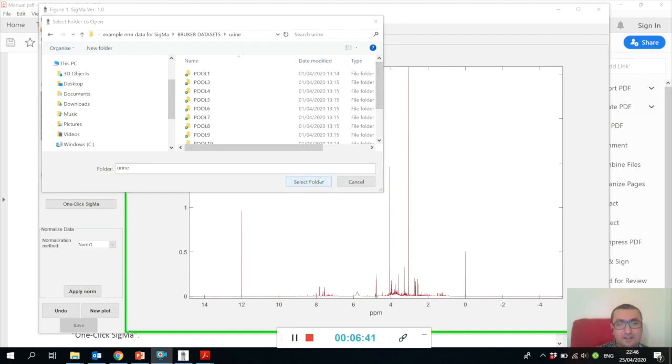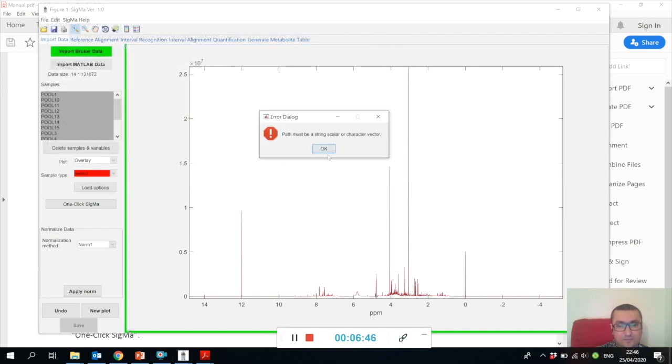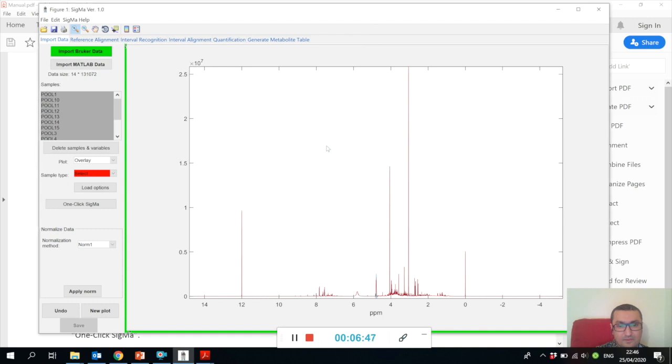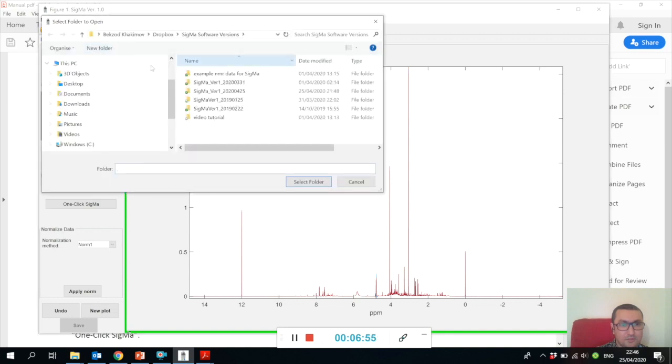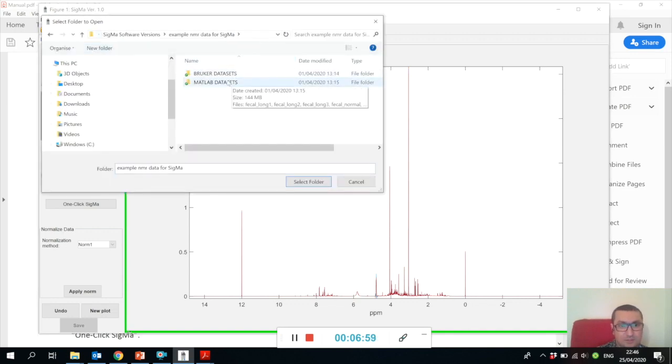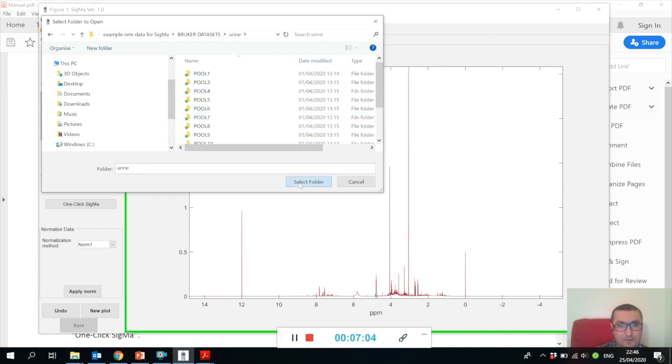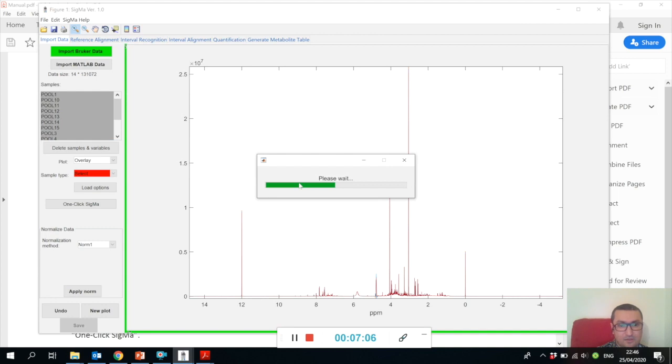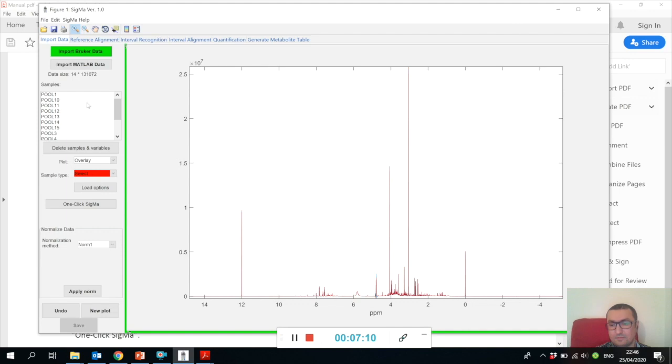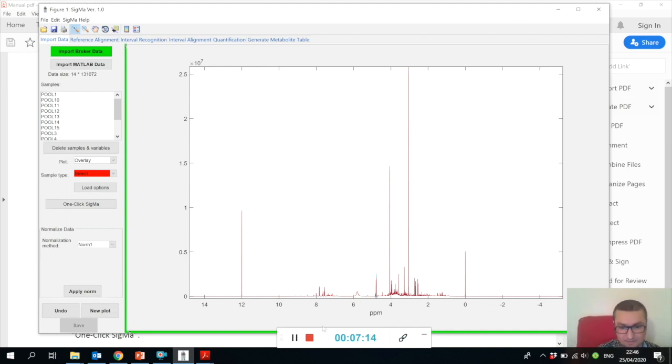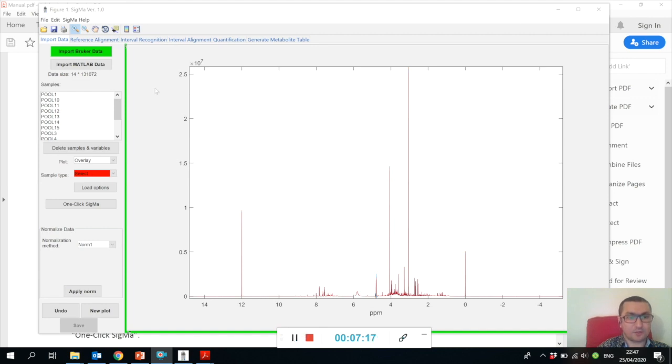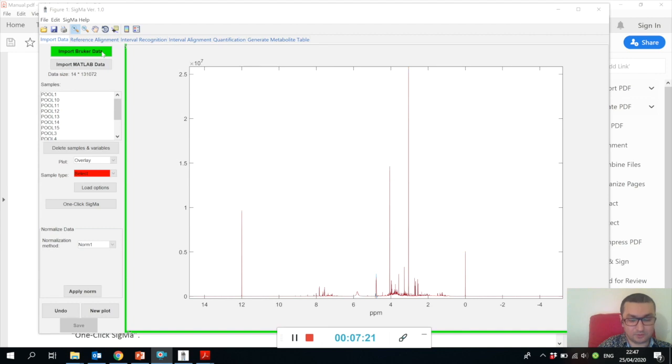Ideally, Sigma checks your spectral sizes and acquisition parameters, but we have seen some error messages coming out. When you start opening Bruker data files for the first time, you may have some error messages, but please do it a second time and then it should work.